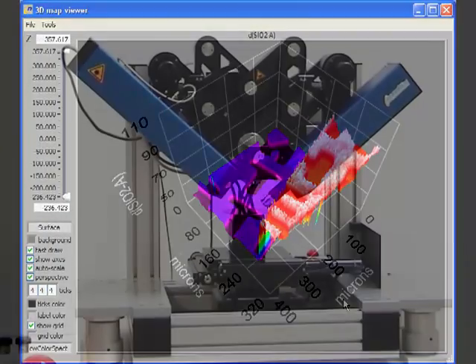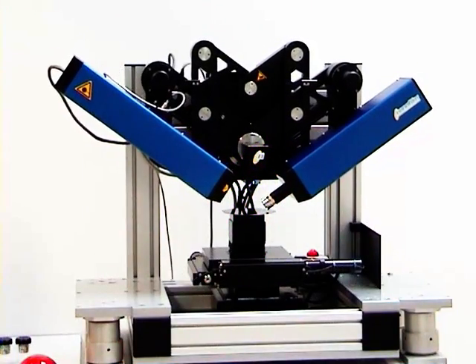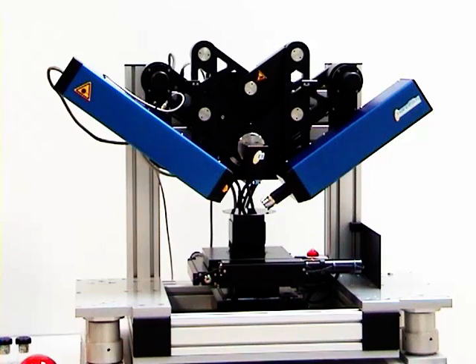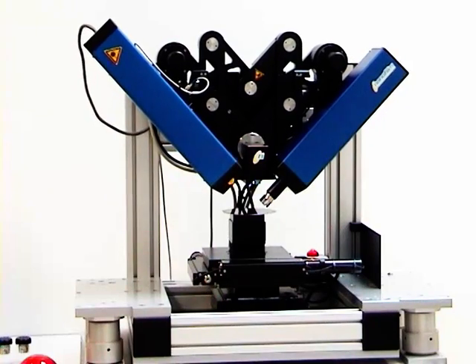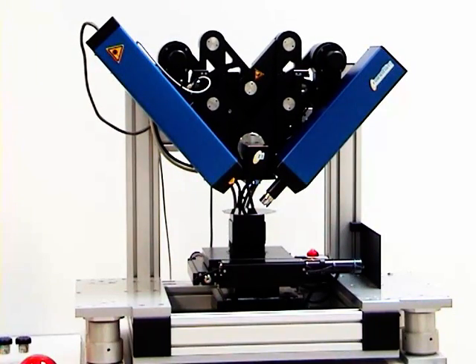A patented, uniquely designed goniometer with free accessibility facilitates the use on shows and unwieldy samples. All angles between 40 and 90 degrees can be set with a resolution of 1 milli-degree.